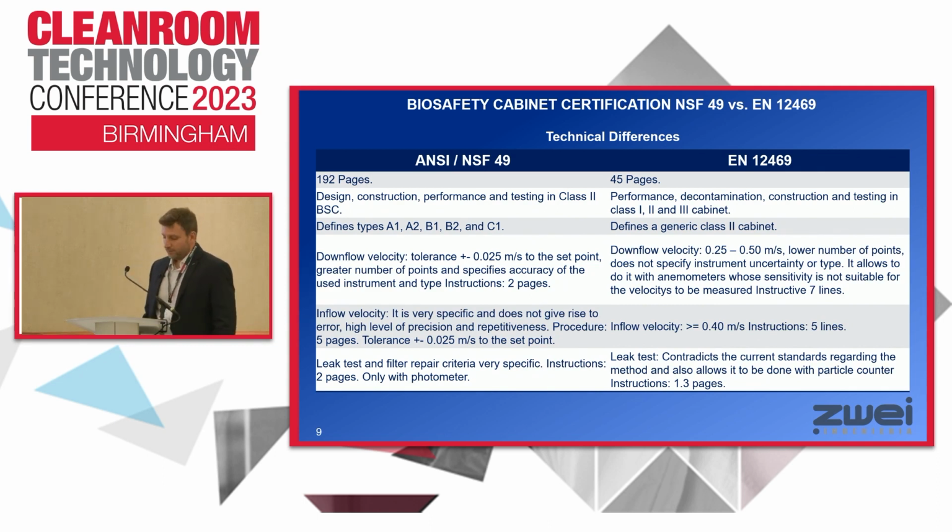Leak test. In NSF, the leak testing is very specific about how to measure the upstream aerosol concentration, how to take the downstream concentration, and how to get the penetration rate to conclude if the filter has a leak or not. NSF doesn't allow this test to be done with a particle counter.